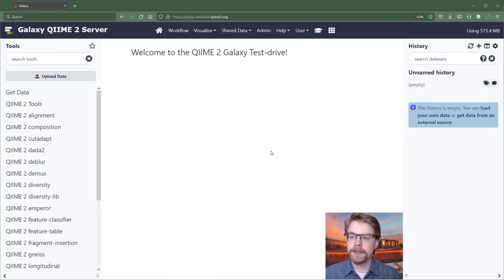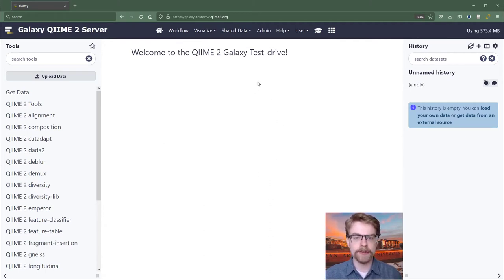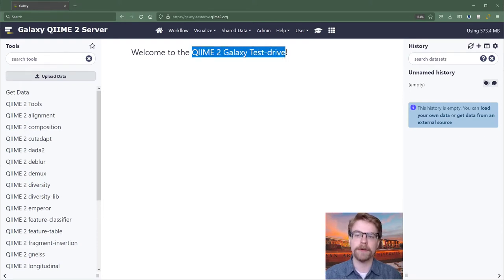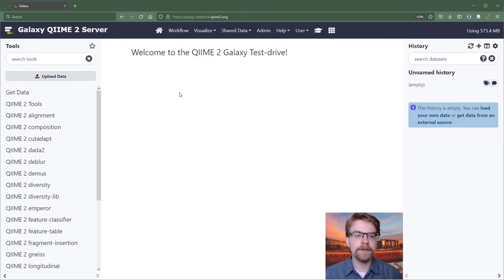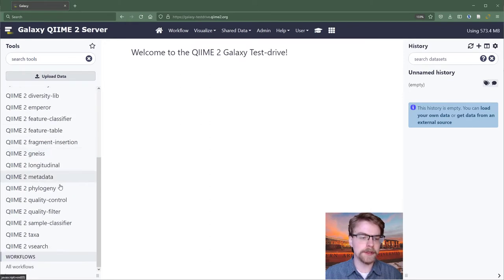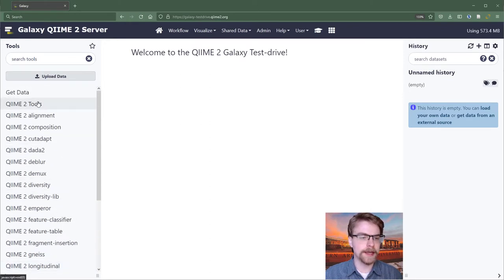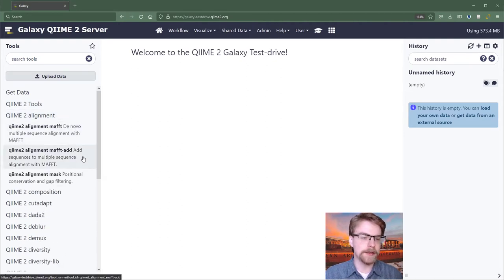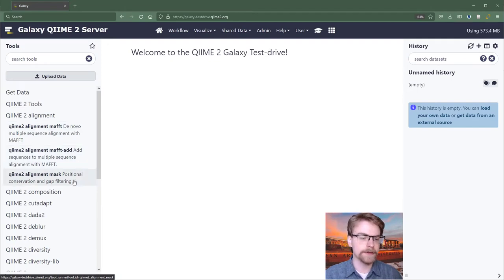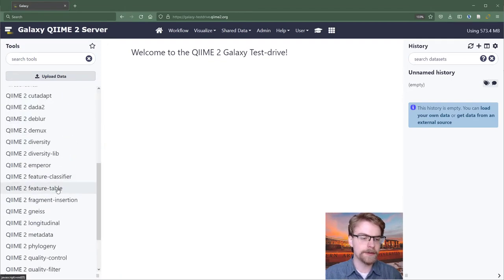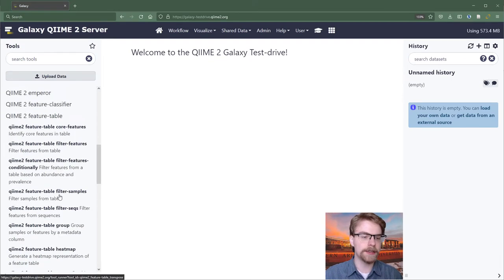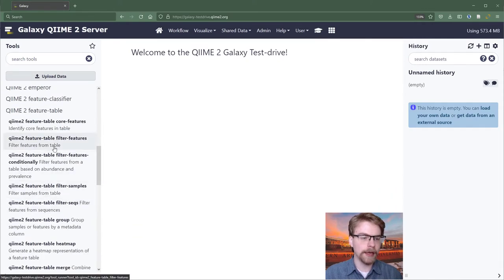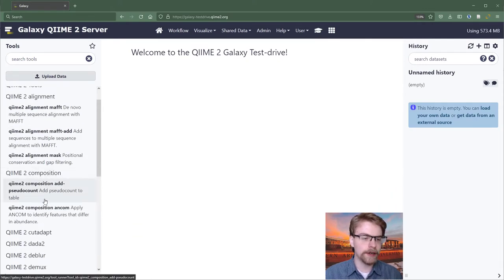To get started with Galaxy, we're going to start on the homepage. You'll probably see something that looks like this. The name of your particular server is going to be different from mine. This is just a testing server while we record these videos. On the left, we have our tools. You can search a tool. You can use any of these tools in these headings. If we wanted to use a plugin like Alignment, we would expand this. And we see there are three tools: Maft, Maft Add, and Mask. There are a number of these, and you can use the one you need to.